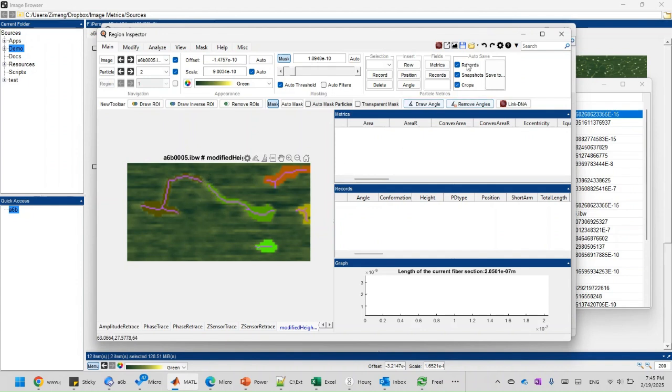Now you can also undo and redo here. Use this button here. I already mapped them as well. Undo is Control Z, redo is Control Shift Z. You have to manually map them into the keyboard shortcuts. Right now I'm just showing you: I say undo, and then it restores the mask, the last step of your masking operation. And then you can also make the eraser big or small. You simply hold the Control key and scroll your mouse wheel up, which increases the mask eraser size. If you scroll down, it decreases the eraser size, right? That's how we do that.